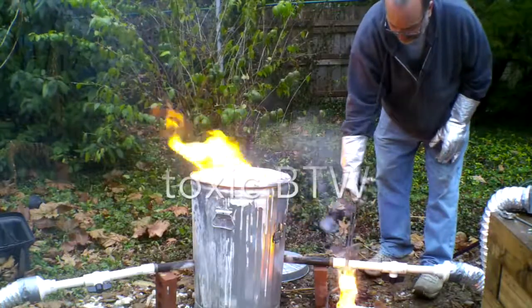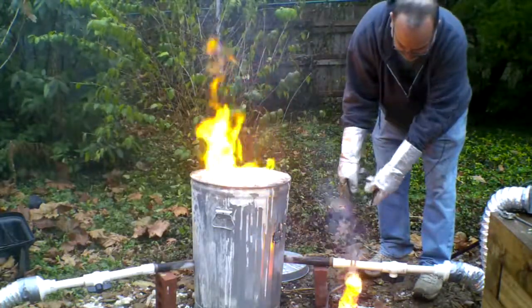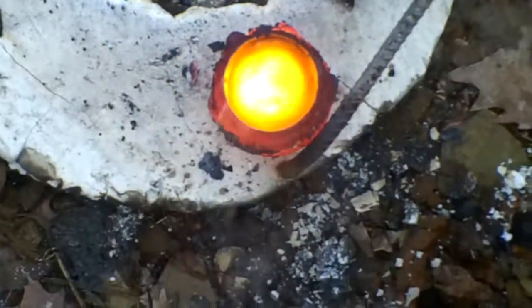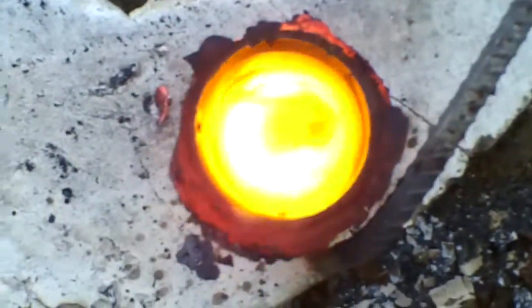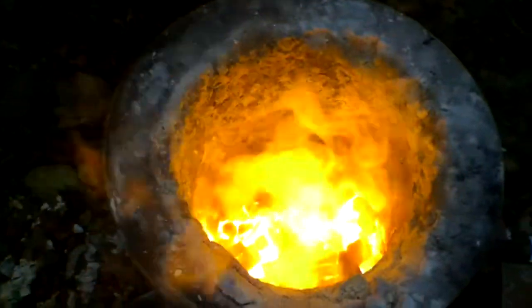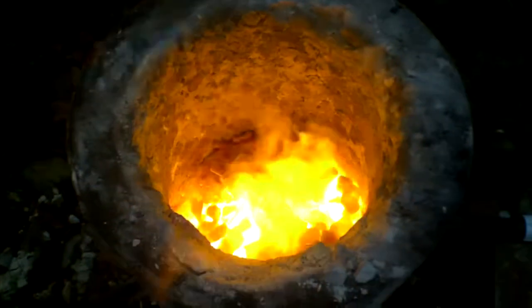That is a sodium fire. That's cool, actually. Look at that. That's a sodium fire. Hey, that's cool. Look at that total coolness. Is that like total coolness or what? That is cool. I have no idea what I'm looking at, but it's cool. Yeah, so that bright yellow flame there, that's my sodium reaction product. Oh well, we'll see what's in the potassium container.